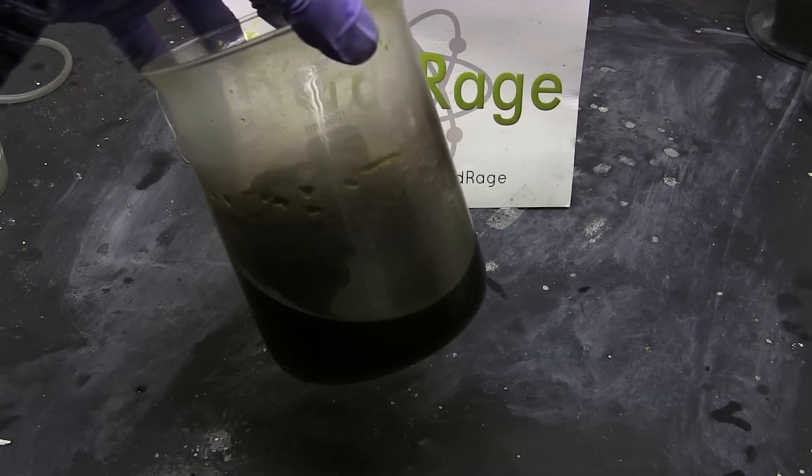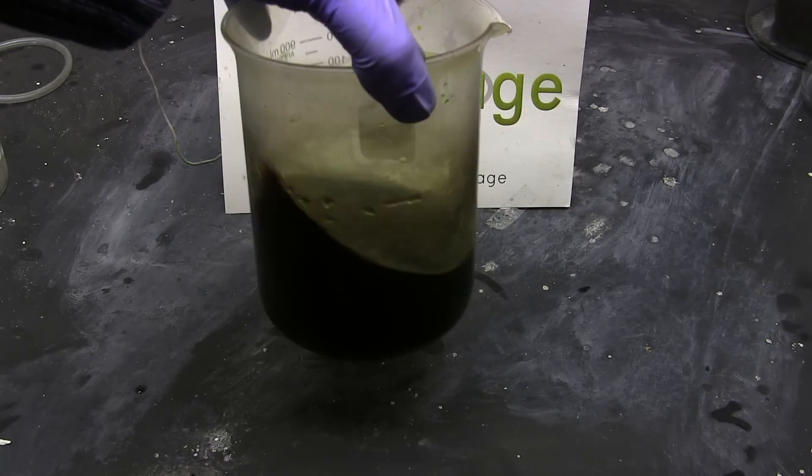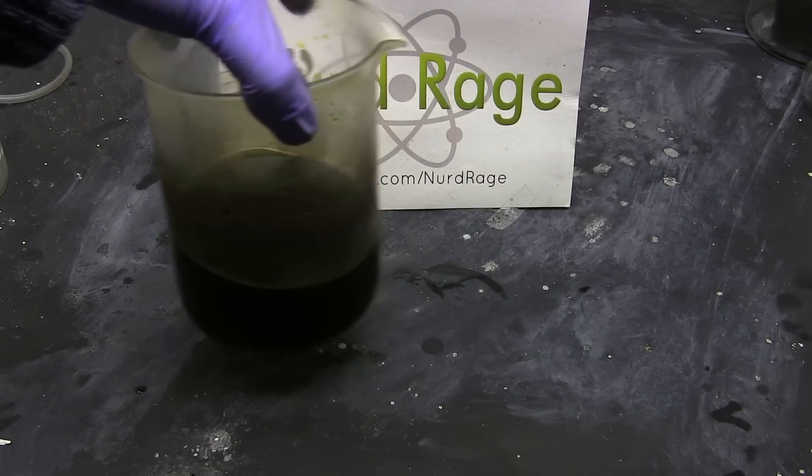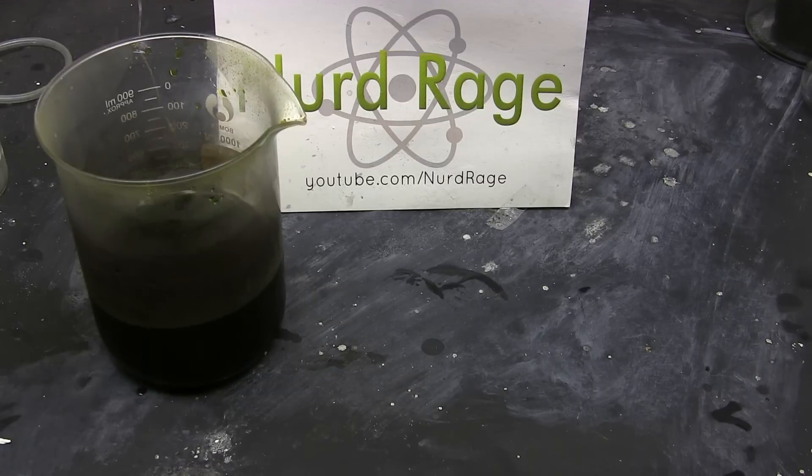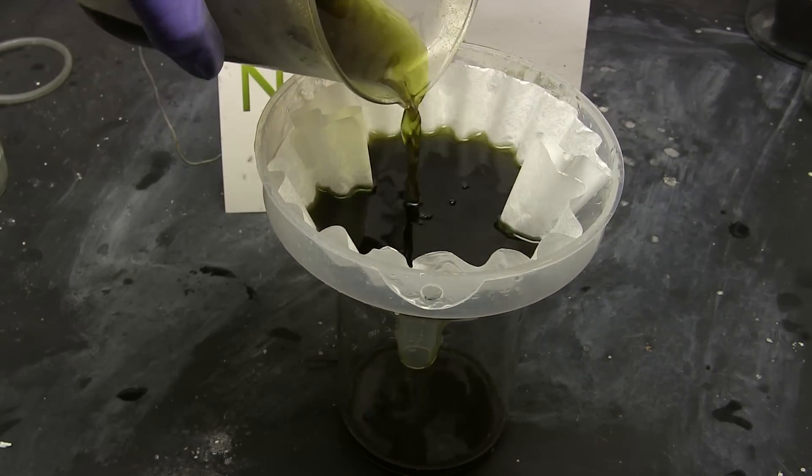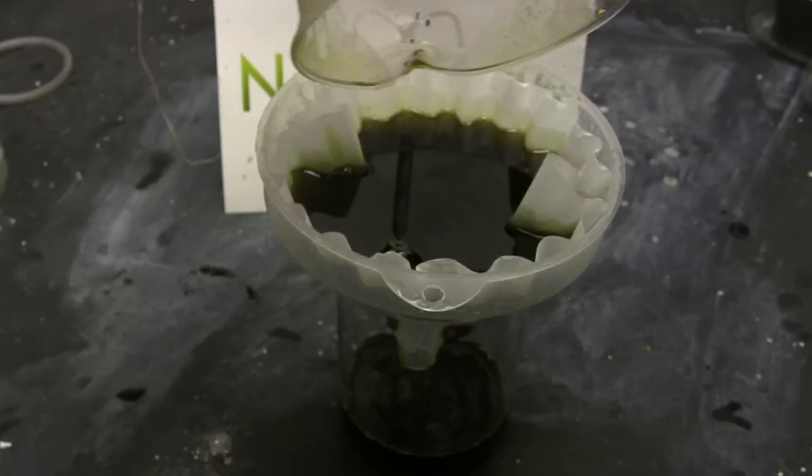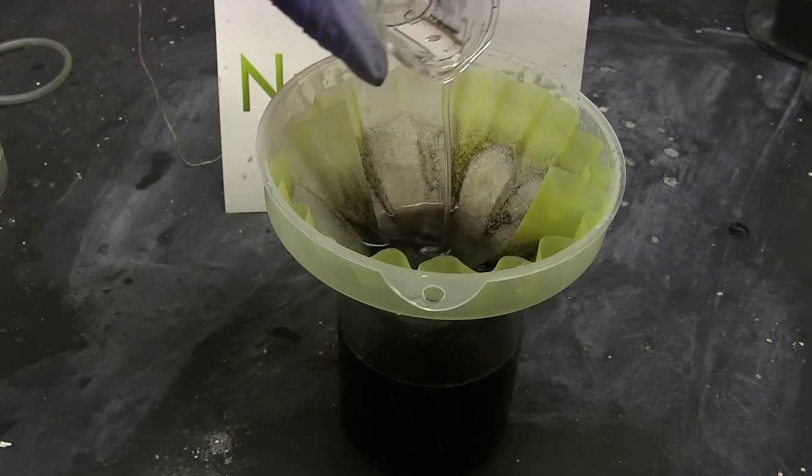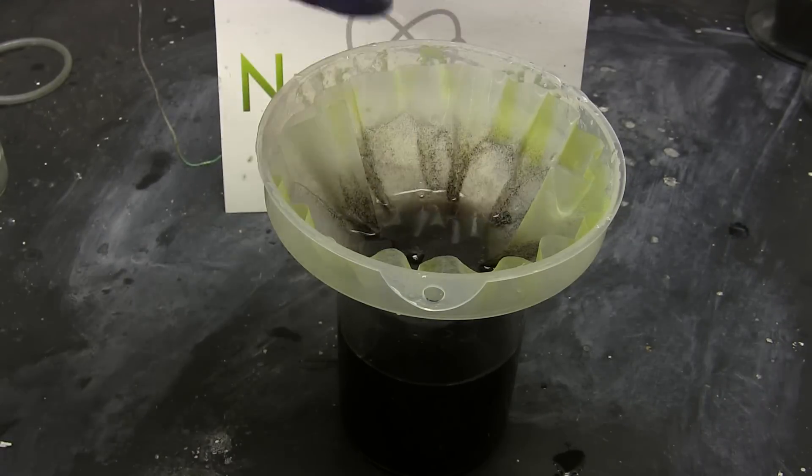So here is our spent ferric chloride etchant contaminated with copper chloride. Take note of the original volume as we'll use that as a guide for restoring it later. I have about 400mL. Now filter the solution to remove any insoluble particles like bits of circuit board dust. You can wash down the filter paper with some deionized or distilled water if you want to maximize recovery.